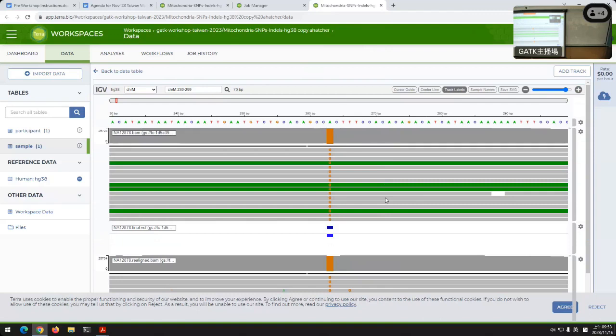But because of that large depth, you have to be careful in how you process it, okay? Again, with that many reads, you're going to have issues with just the natural, relatively low 1 in 1,000 baseline error rate of the sequencing. It piles up. So a naive caller might not be able to handle it. They can just downright explode. But that's why we gave you the special version of Mutect in here.